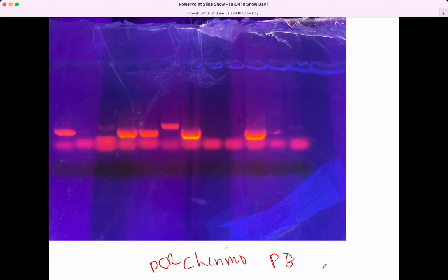And so we have prothoracic gland tissues that I collected at 12 hours and 24 hours. And remember, the timing is always based on when the animals are put back on food. So they are identified as they molt from the 4th to the 5th growth stage. And when they're molting, they can't eat. So they're temporarily removed from food, and they complete the molt, and they all are hungry and ready to go, but they don't have food. And the start of metamorphosis is dependent on nutrient input, and so we put them back on food all at the same time, and we get a really synchronous start.